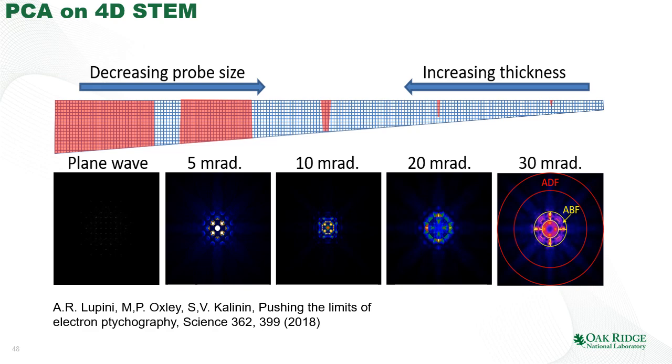What's interesting here is that in the case of the electron microscope, the size of the electron beam can actually be much smaller than the distance of the atoms. In some sense, you have a diffraction when your distance between the scatterers is much larger than the excited volume. So in some sense, it's a diffraction in wonderland.